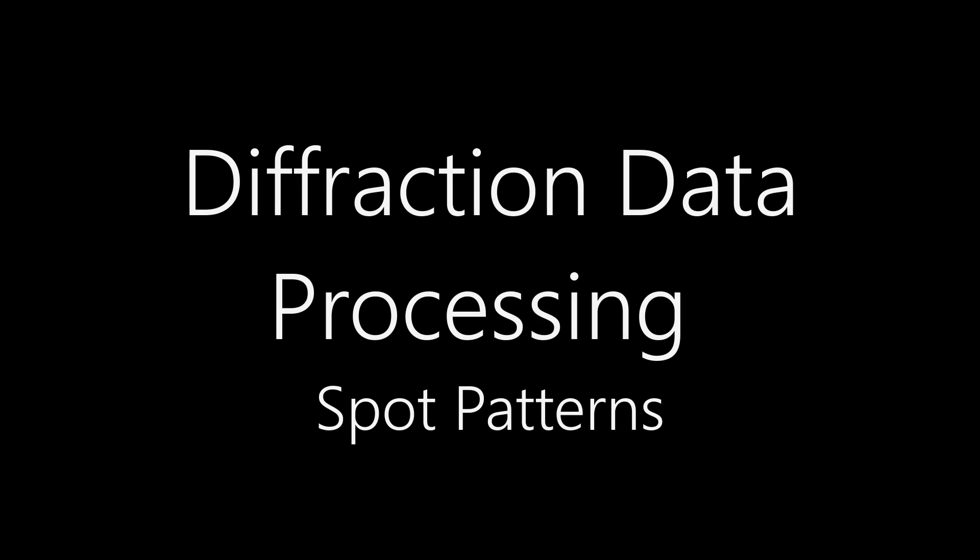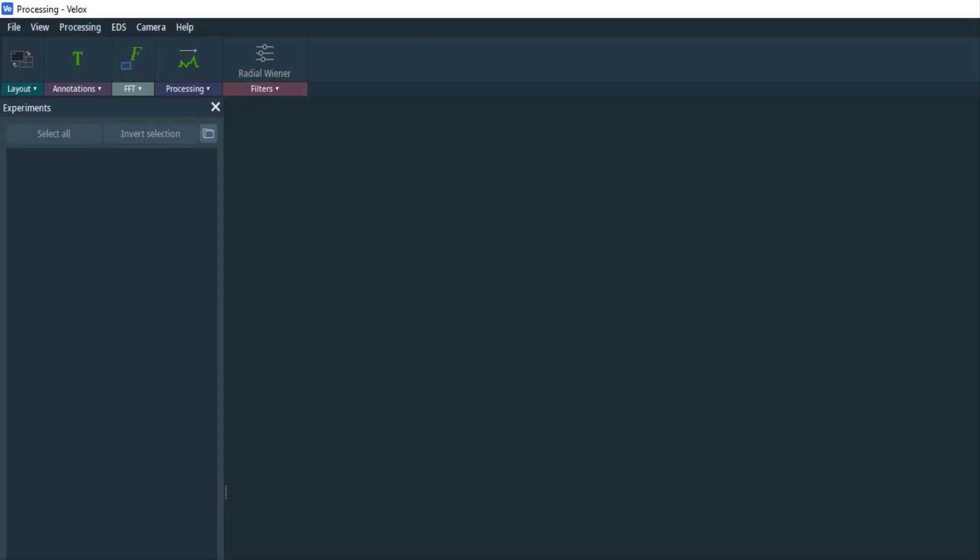In this video I'll be discussing how we process electron diffraction data from spot patterns that we obtain on the TEM. Just a heads up for the measurements, I'll be using the Thermo Fisher software VLOX. If you don't have access to VLOX you can use free software like ImageJ. The overall process I describe is the same and it's really independent of the software.